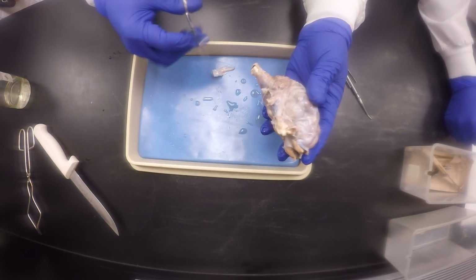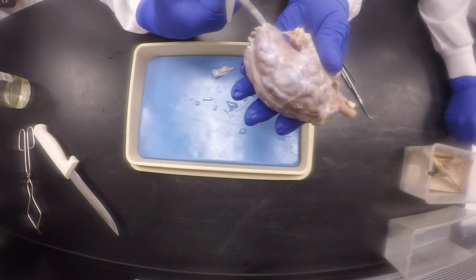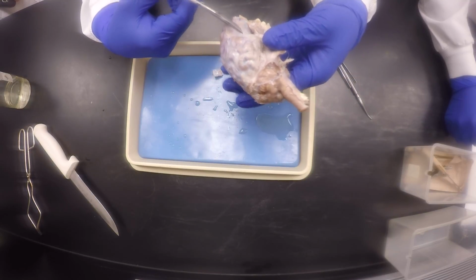So I go to the other side. I could start here too. I start right here at my olfactory bulb, and then I just do the same thing. That's what I do.